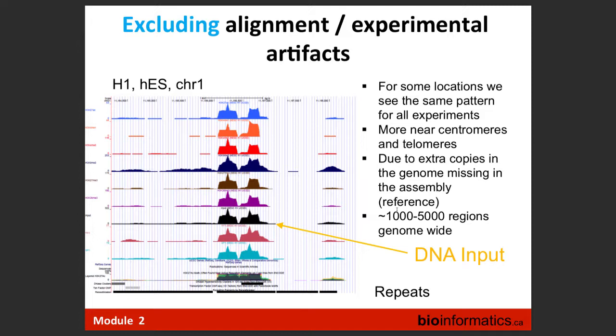So now, these are exactly the same data set which you already saw. These are those profiles which we discussed, and you see all the marks. Of course, if we have 6 marks and see a picture like this, probably each of us will be a little bit suspicious of what's going on there, because we have identical profiles.